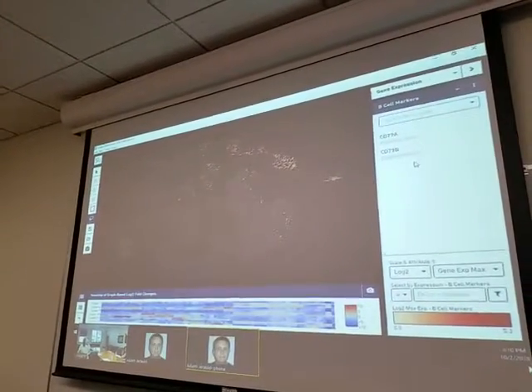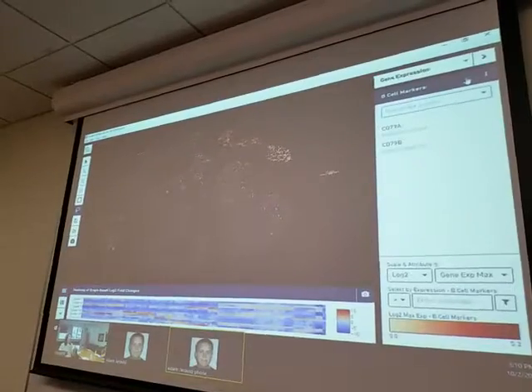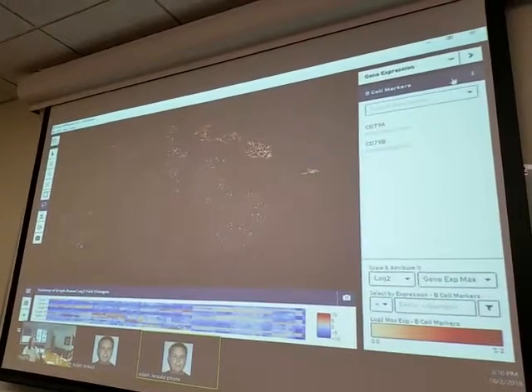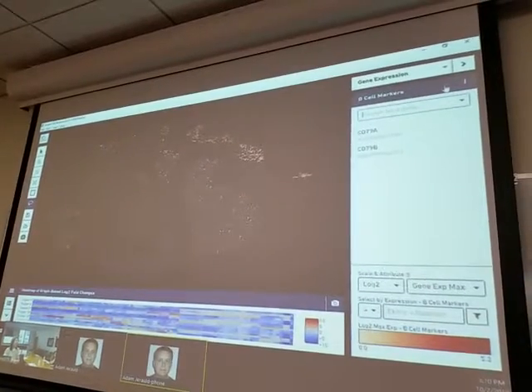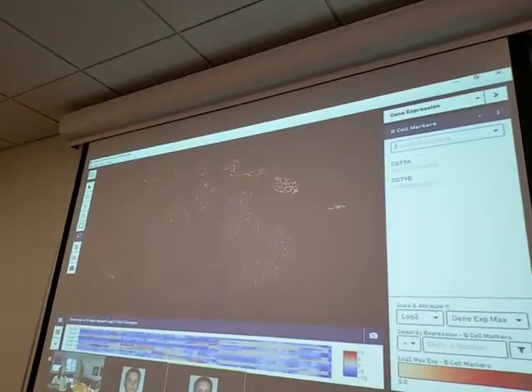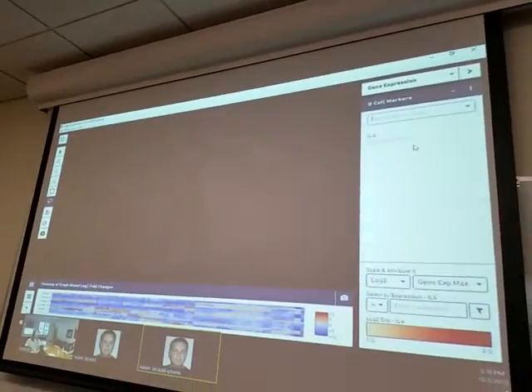Well, the real problem for us is that these are PBMC, so the different cell types have very distinctive gene markers. But we want to zoom into within B cells, and of course when we do the t-SNE, let's say we're interested in IL-4 receptor, we don't see it clearly form a cluster. Right, it's dotted around. It doesn't form a cluster at all. Can you let him do this part, and then we'll go to that. So go ahead with what you're doing here.